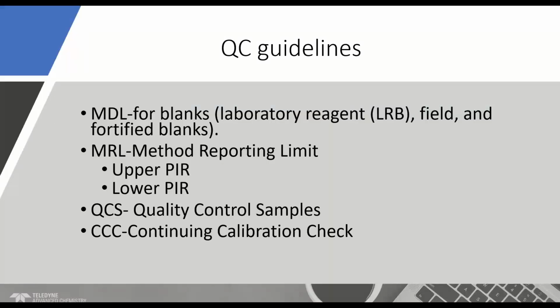As I said before, in the QC guidelines, the MDLs are no longer required and were replaced with minimum reporting limits. It is defined as the lowest concentration such that the probability of recovery between 50 and 150 percent is at least 99%. In the core aspect of monitoring and reporting, these are the core principles that are important in QC guidelines to justify that sample integrity was maintained throughout the schedule. There's also the pillar for troubleshooting when a problem may occur, helping you identify when it may occur when you're reviewing your analysis.